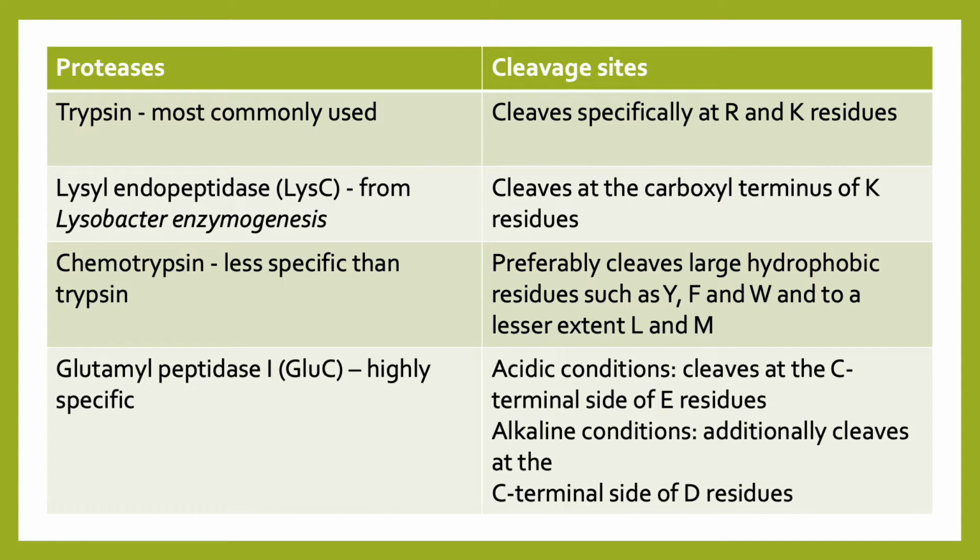Another common protease is an enzyme from Staphylococcus aureus, Glu-C, and it is a highly specific protease, particularly at acidic conditions. This enzyme cleaves at C-terminal site of glutamic acid residues, while at alkali conditions, it additionally cleaves at C-terminal site of aspartic acid residue. This protease can be used singly, but it has been shown that proteases with different specificity, when used in combination with each other, can improve the coverage of amino acid sequence and the level of proteome exploration.